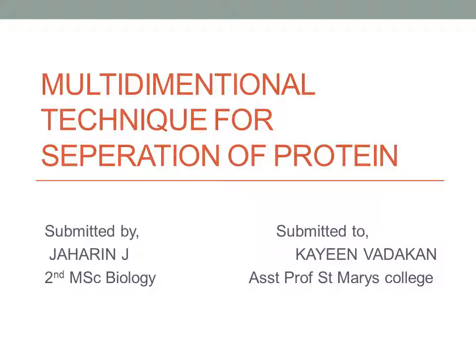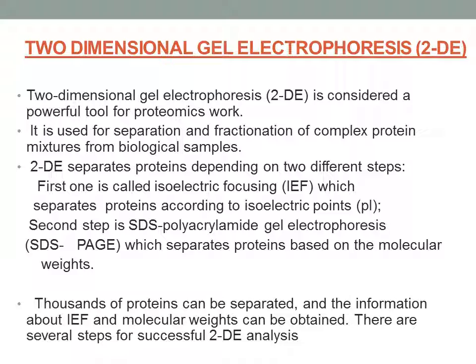Today we are going to discuss multidimensional techniques for the separation of protein. Two-dimensional gel electrophoresis. Two-dimensional gel electrophoresis is considered a powerful tool for proteomics work. It is used for the separation and fractionation of complex protein mixtures from biological samples.